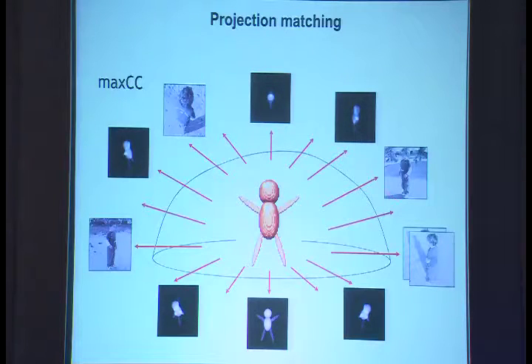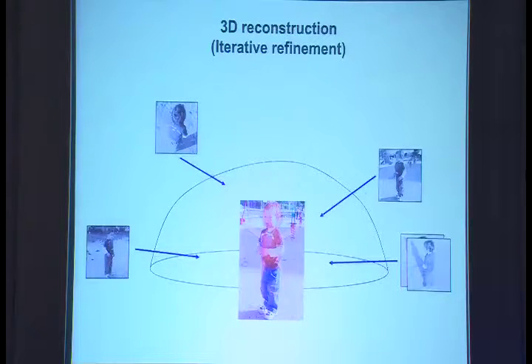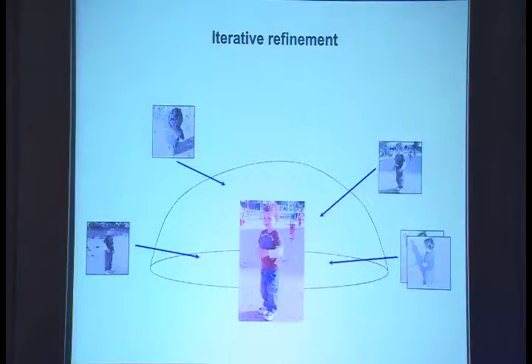And then you keep doing this for these two. And when you do the 3D reconstruction, you tend to get an underlying signal, which is of the boy here. Then you refine, you get the orientation better and better, and eventually you should be able to see the real image which is lying under here. So that's the basic idea behind projection matching and how you iteratively refine the orientations and get better maps.